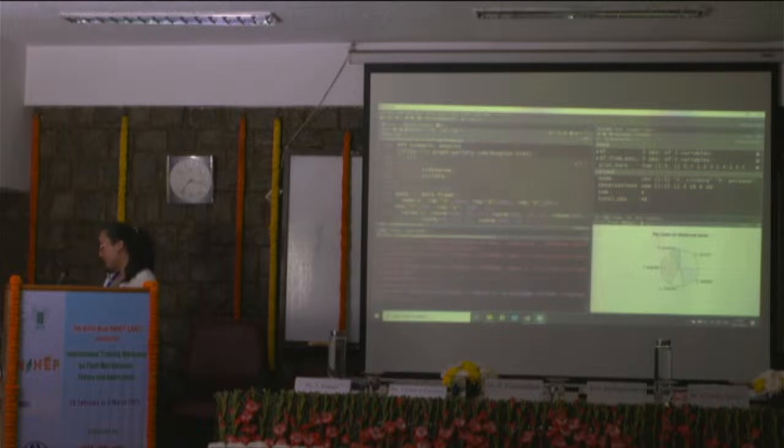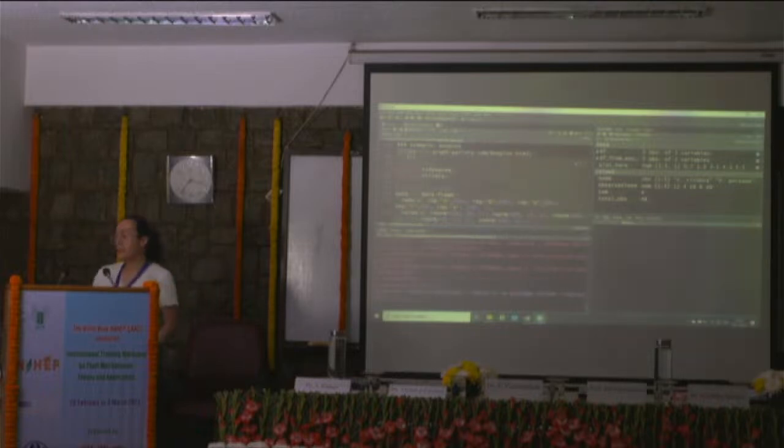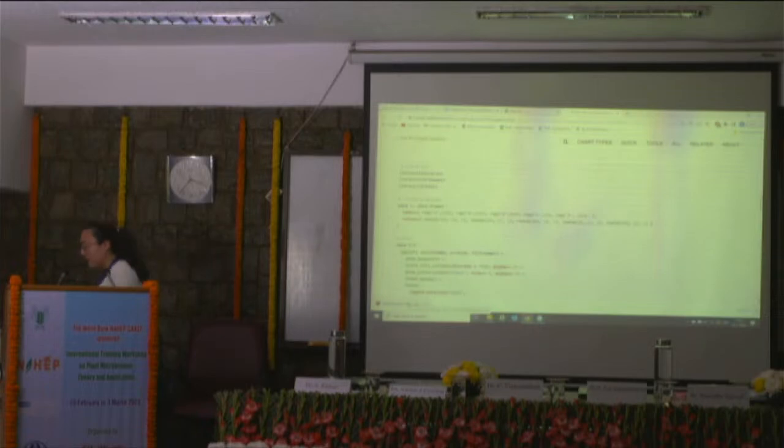And now if I run the chunk of code, you can also do it, the ones that have it. Oh, I don't have this library. Guillermo, how do you have this? Okay. Yeah, we need to install them, but since we were having issues installing, I think we can leave this for later. But then my takeaway message would be, you can really go there and retrieve whole codes for very cool plots. And then, so this is for plots.